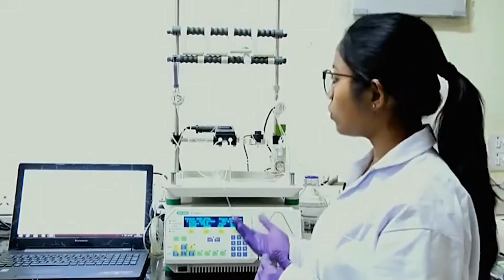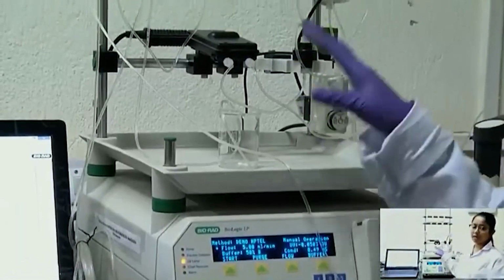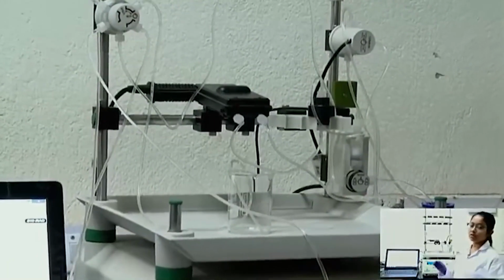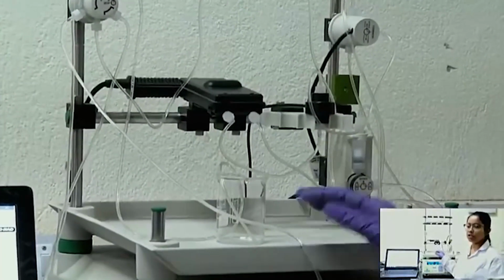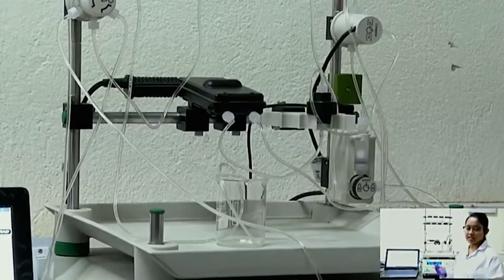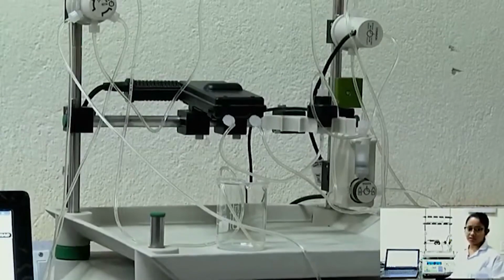So, before we load our protein sample, which is present in that particular wash buffer, we first need to equilibrate the column and all the tubes with that same buffer. For that, before we load our sample, we need to run the wash buffer, which has this Tris, NaCl and imidazole, for almost again 10 minutes or so.